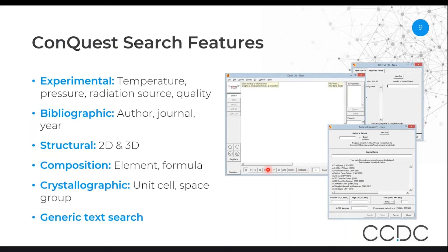It has a wide variety of different search fields. You're able to search based on experimental properties such as the temperature of data collection, the pressure, the radiation source — such as if it's neutron or X-ray — and the quality of the data. It also allows for bibliographic searching, such as the author, the year of publication, or the journal that the structure was published in.